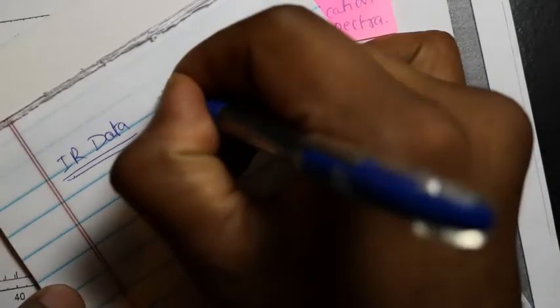Let's see what functional groups contain a carbonyl group.